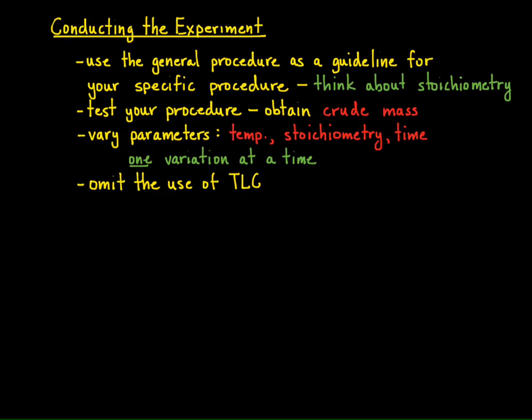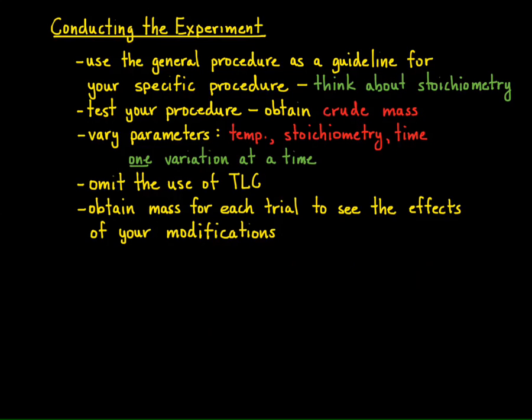Of particular note, the procedure describes monitoring the reaction by TLC. This is unnecessary and will be omitted from the procedure. Run as many variations as time allows and obtain a mass for each trial to track the success or failure of your modifications.